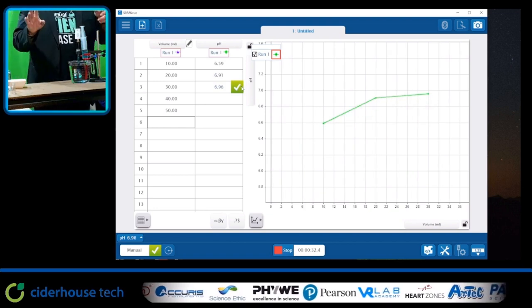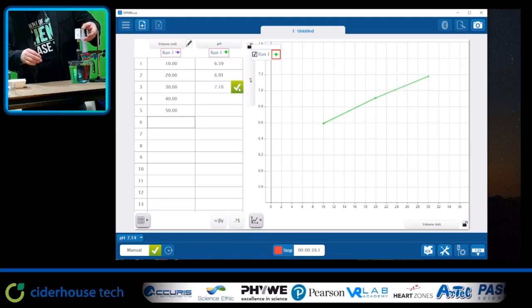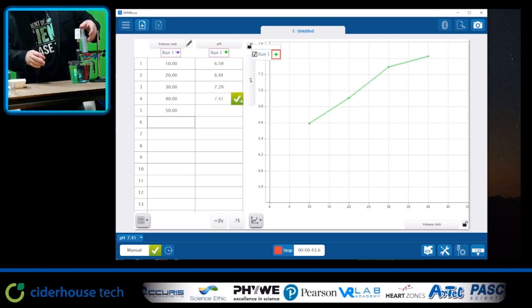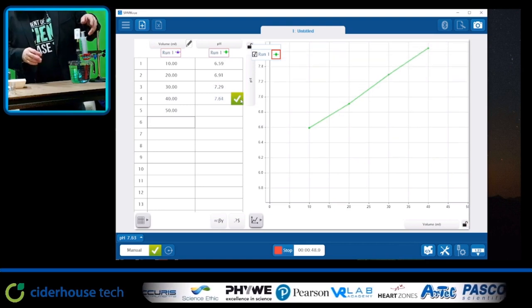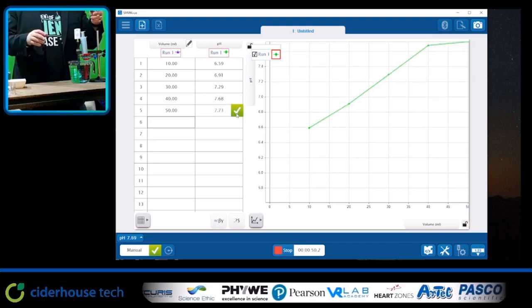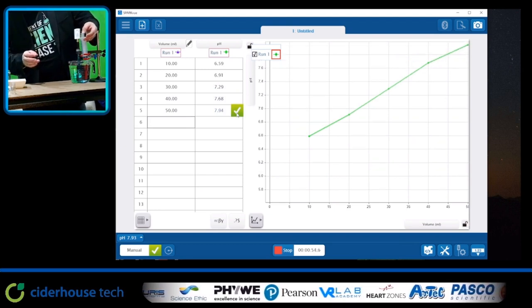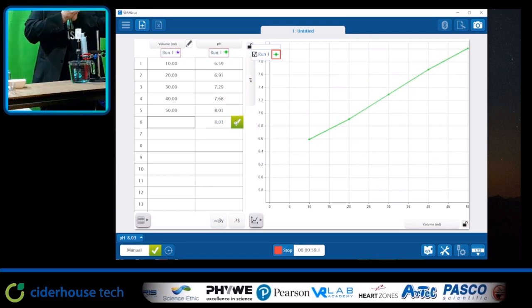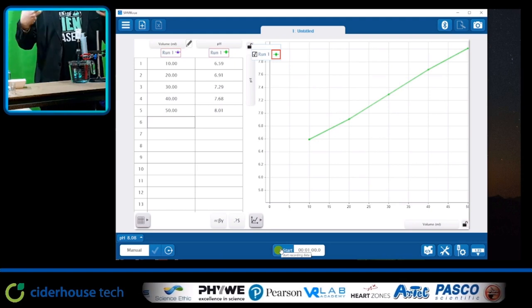As you can see, the readings are starting to come. I'm going to add another 10 mils, and press the tick again. Add another 10 mils, and again, press the tick. And add another 10 mils. So now we have 50 mils in there. And now press the tick. Now if we press stop, we now have our data that we've collected.